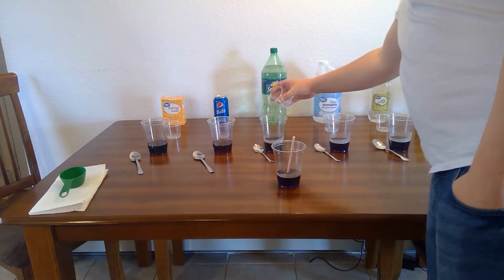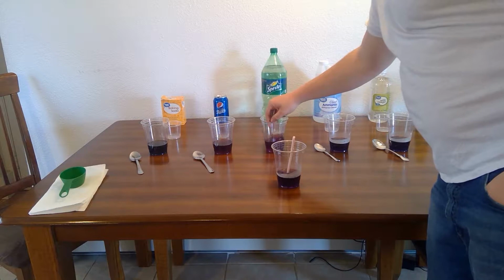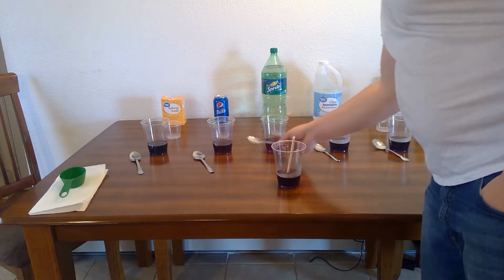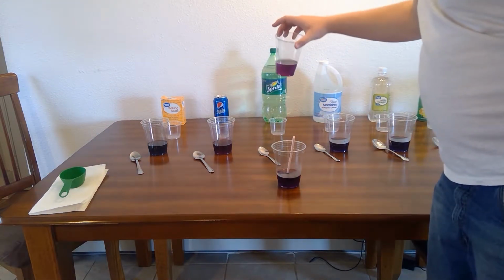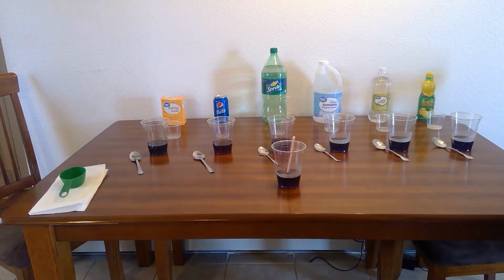Next is the Sprite. The Sprite is actually a little pinker than the Pepsi, so that's good to know that your different sodas are going to have different effects.